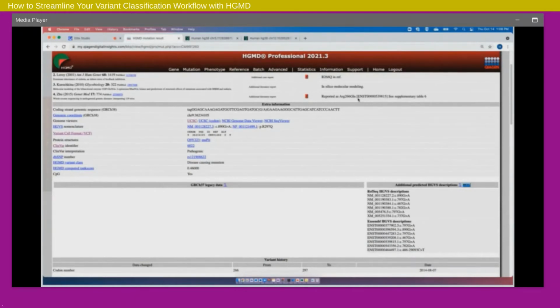And so you can match it up, that 815, and from here it gives the c. dot, but you can confirm that the 797 G to A is actually this 266Q if you translate it to amino acid.